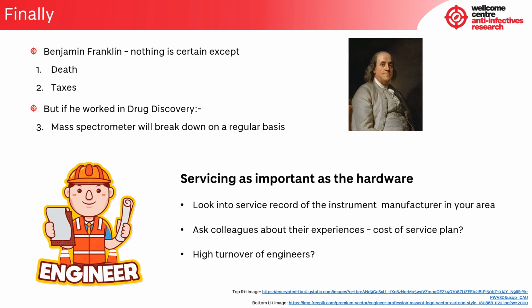Do they have a high turnover of engineers? That's usually a bad sign. Ask colleagues about their experiences of the servicing, and also ask about the cost of a service plan. These can often seem expensive, but when you take into account the fact that it covers call-out charges and the cost of materials and spare parts, it can work out cheaper in the long run.